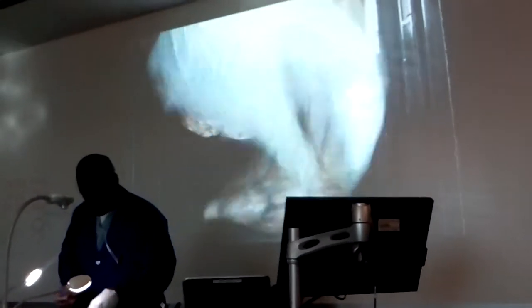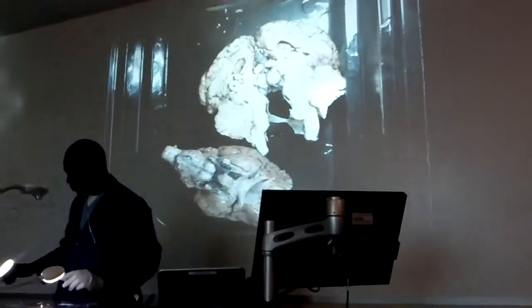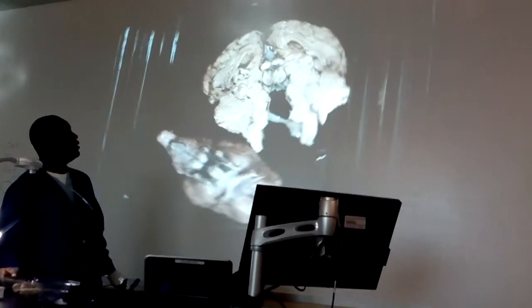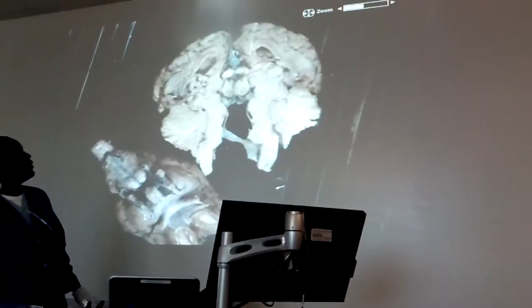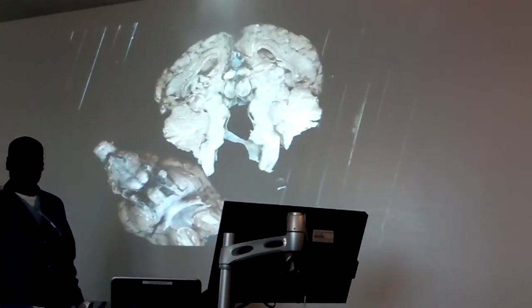And when you do that, that's a perfect dissection. When you do that, you get this. That's pretty good.